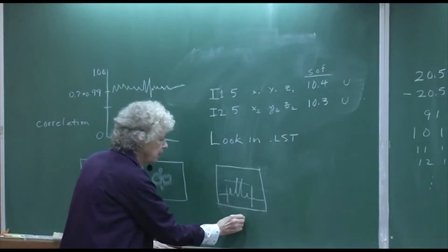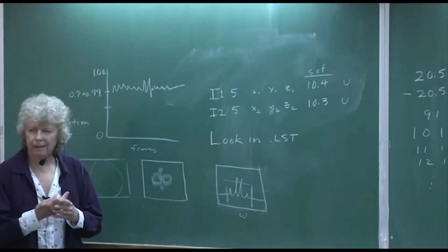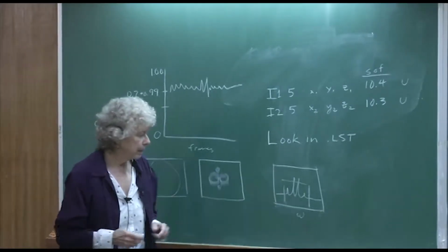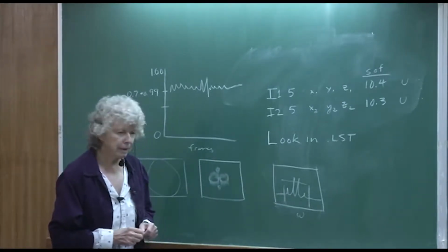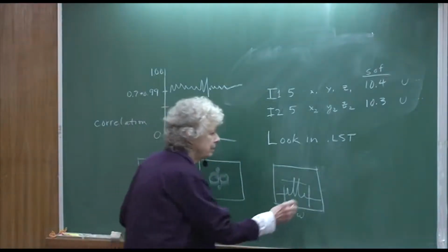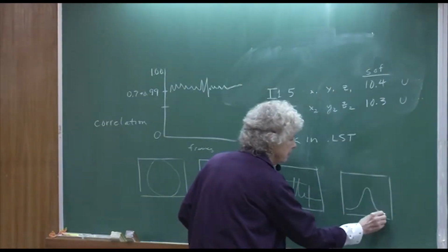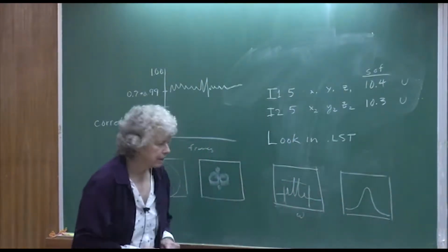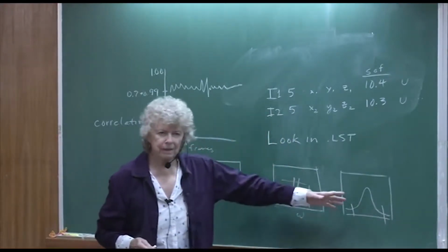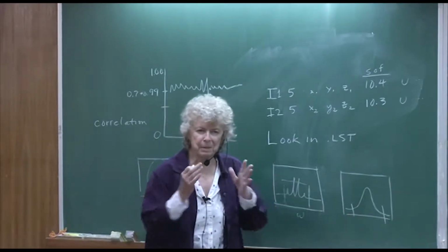This is like omega down here that's being plotted. So by adjusting the box size during integration, you can pick that all up. And another thing to do during integration, if it's a really broad peak, too, you might want to consider fixing the box size so that you're always getting the whole thing, because in some regions of reciprocal space, the spots may be broad, and in other regions they may be narrow.